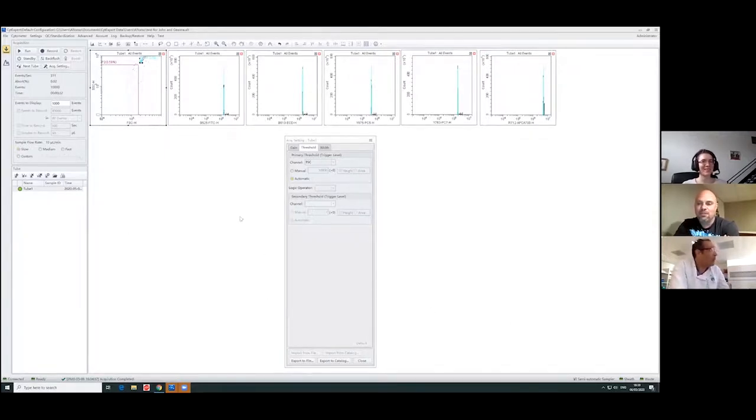So what I will do now is, Jenna, I will create a new tube, okay? And you will see a few things happen. So the first thing I'll do is I'll rerun the same sample. So I will press run, and we'll still see the same samples with the same settings. What I want to do is change this. If you see now, my threshold is automatic. The machine automatically looks at your sample, detects where we have mostly of the events and where the noise is coming from, and it blocks. Based on mathematical modeling, don't ask me, okay?